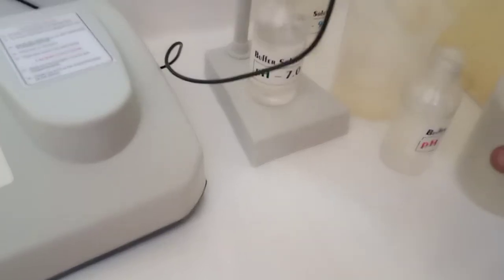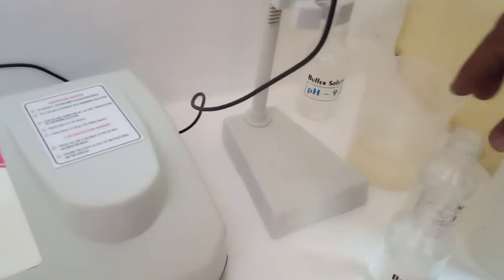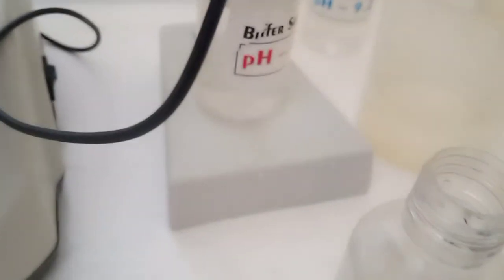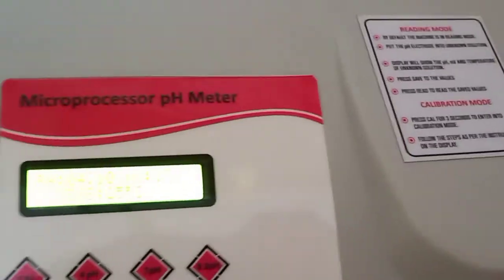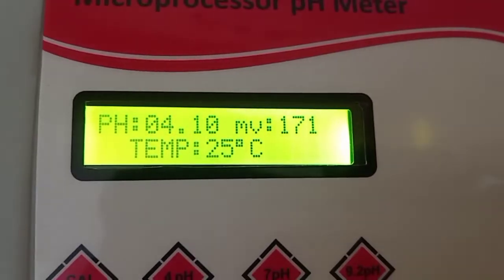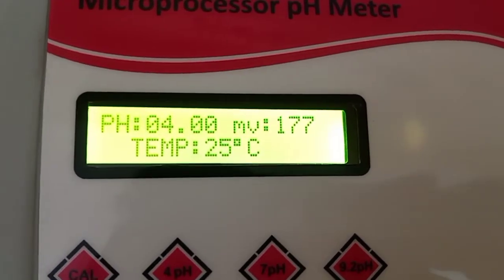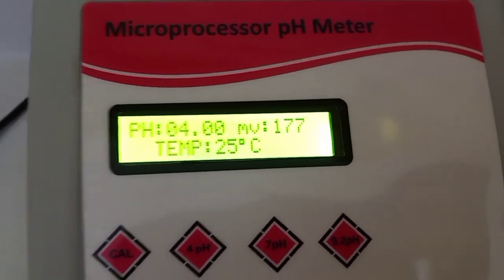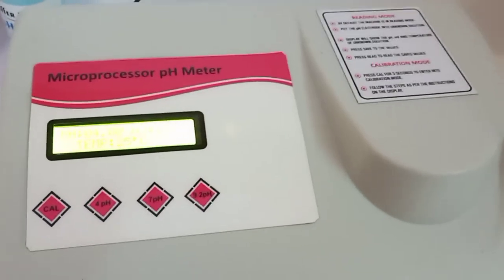We will also check the 4 pH buffer. Again, wash the electrode thoroughly with distilled water and put the electrode into 4 pH. The machine is now showing 4 pH — millivolt is 177 and temperature is 25 degrees. The machine is now ready to take any sample value. Thanks.